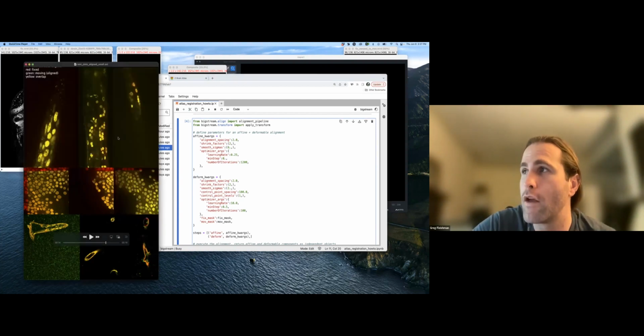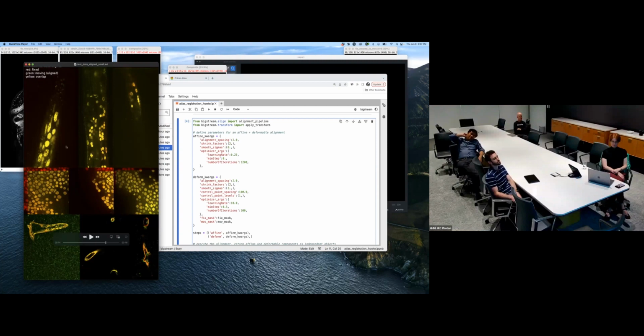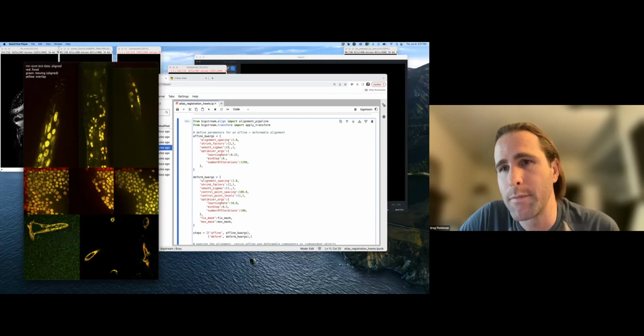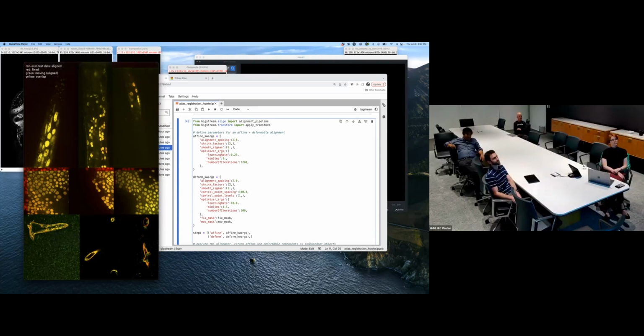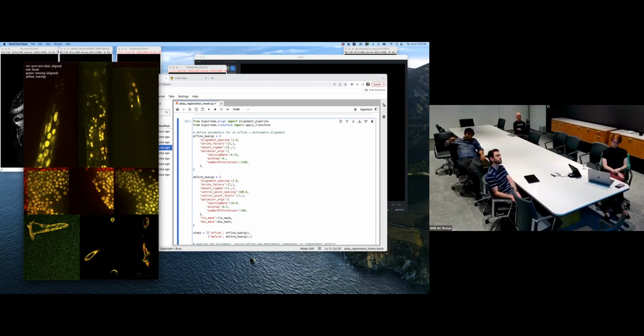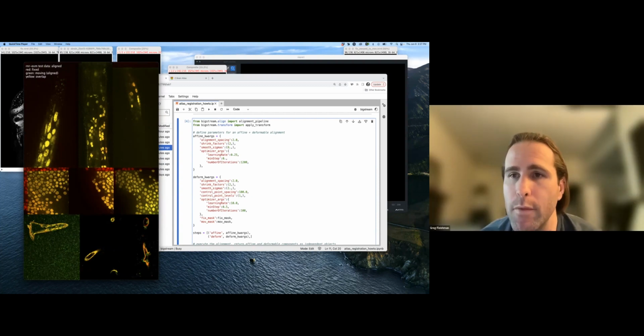These are all C. elegans, these are all zebrafish, these are all mouse. In most of these cases, it's a slightly different parameter set that actually succeeds. Which makes automating large scale projects harder, because you have to go in and sometimes tweak things on your own for different subjects. But yeah, that's what's available, really.